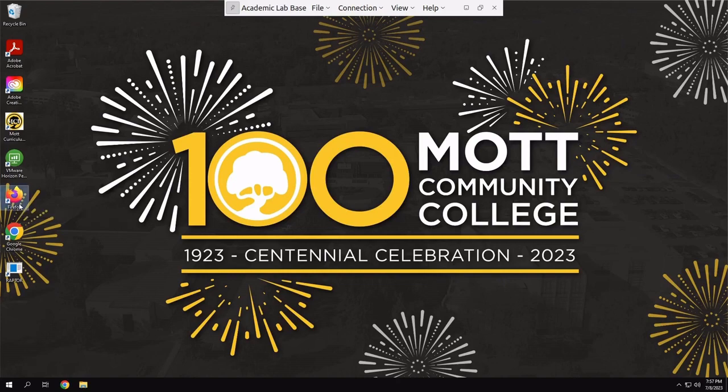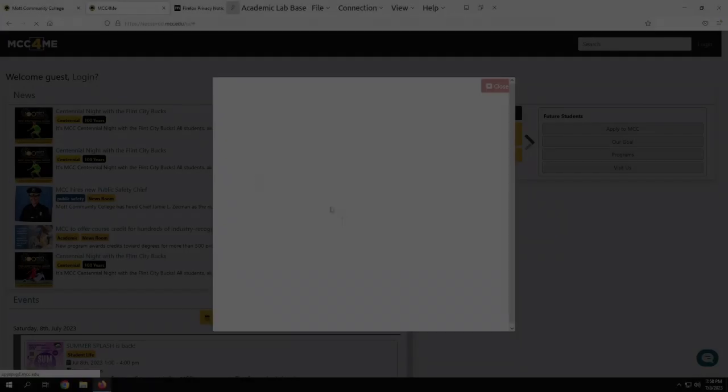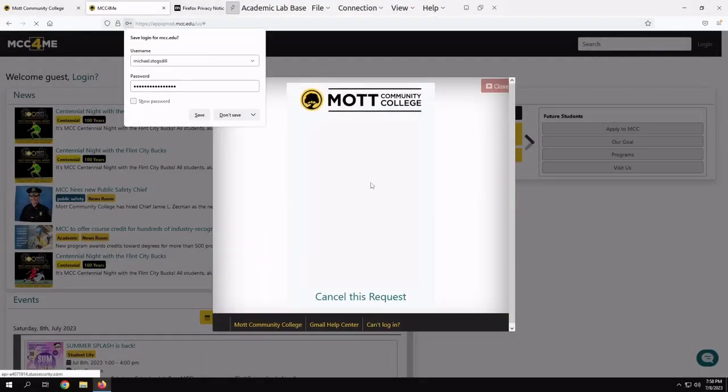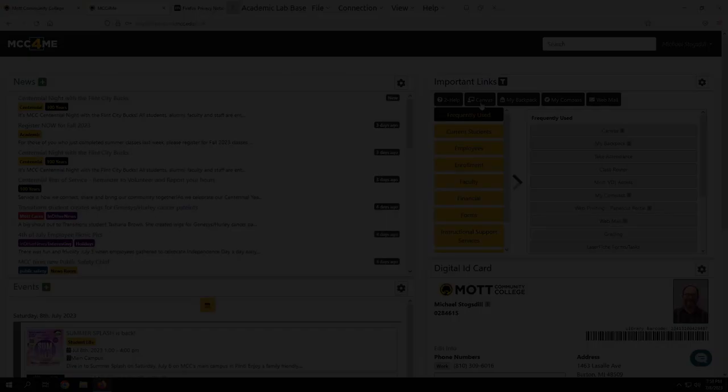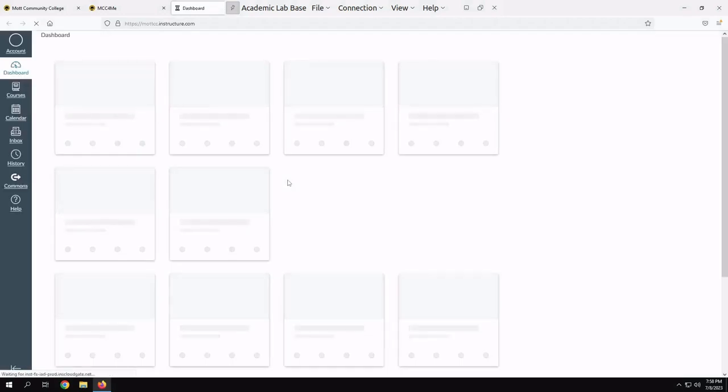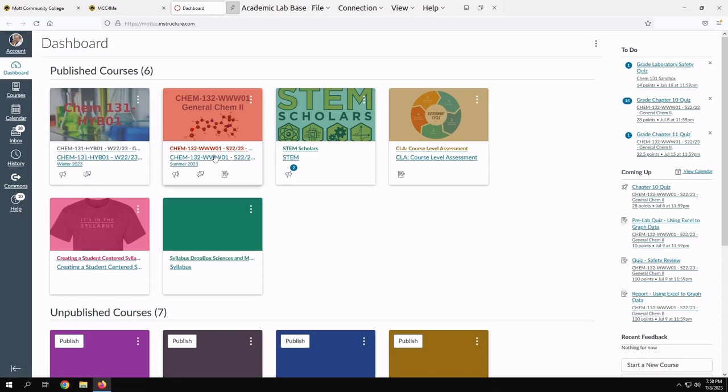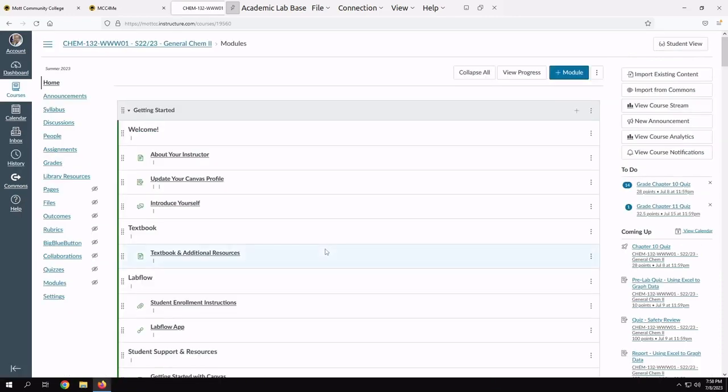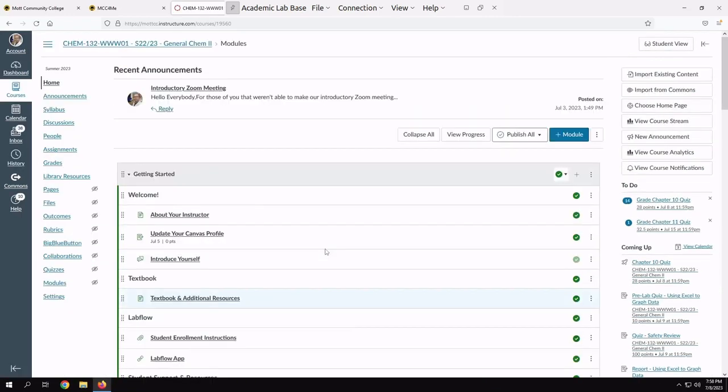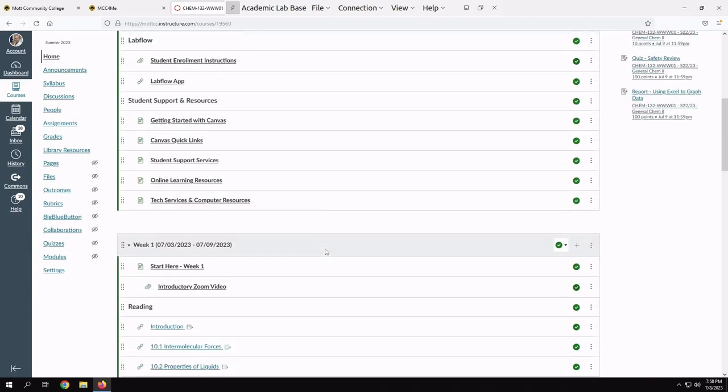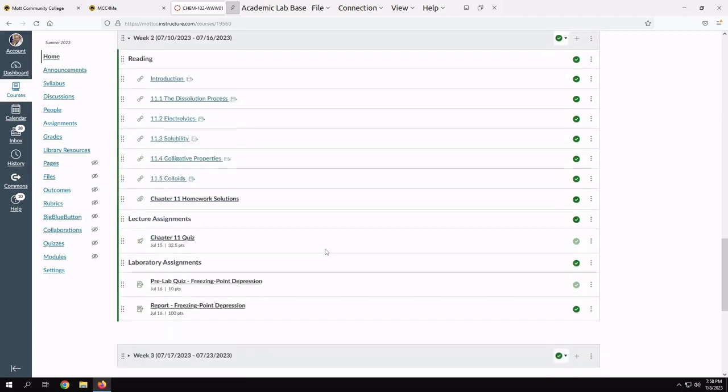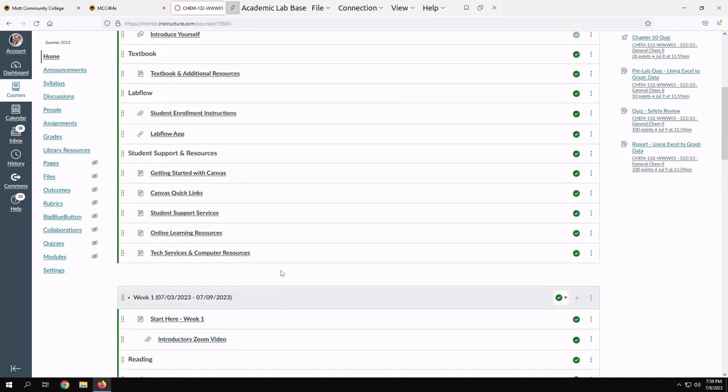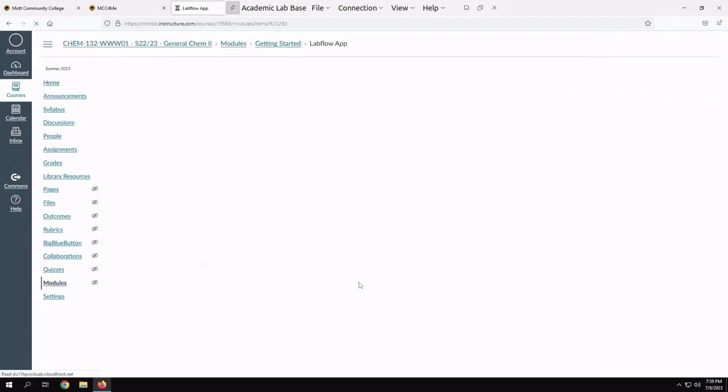So now what we're going to do is we're just going to open up Firefox inside of the VDI, navigate to Canvas, open up our class here, and then we need to get to LabFlow from here. You should always go from here to LabFlow. You shouldn't try and log into LabFlow directly. We could go down here and click on one of these links to our assignments. It doesn't really matter. They all just wind up taking you to LabFlow.